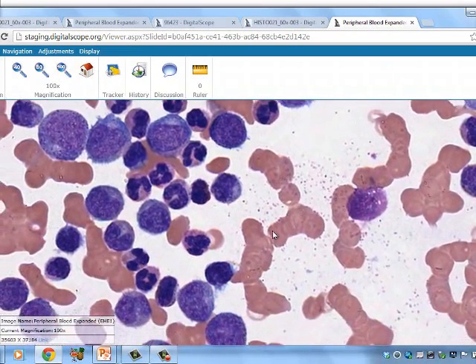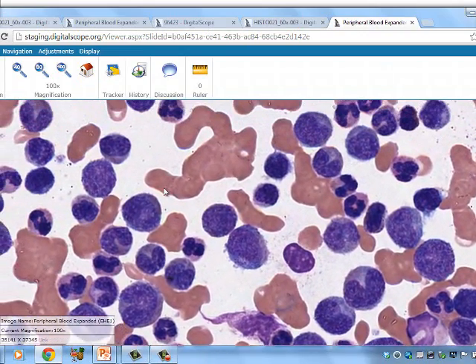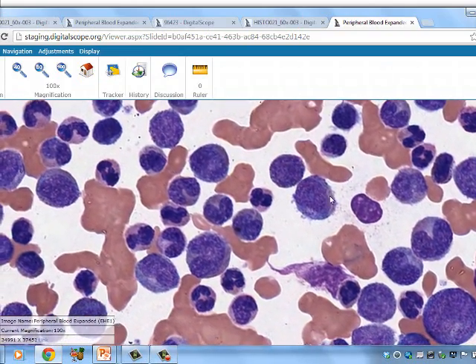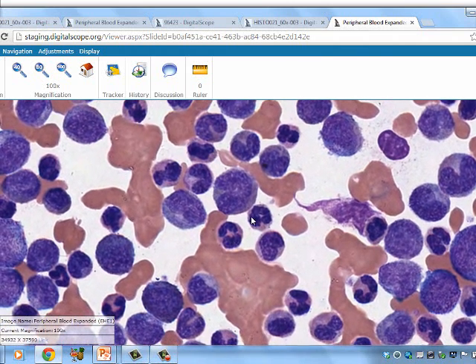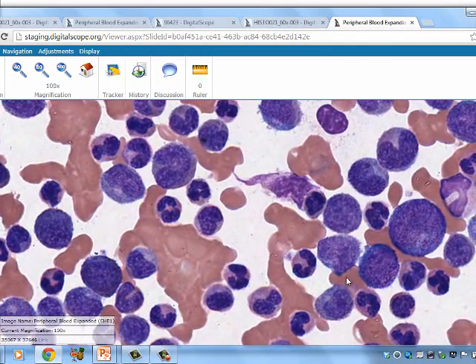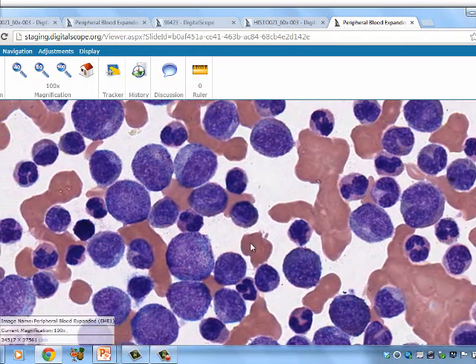And we see the red blood cells, as you see throughout there. This is just debris there. But these would be the individual red blood cells. They're stacked together on these, there's 1, 2, 3 stacked together. These would be the neutrophils that we've seen before. They look a little bit odder. But then we see a lot of these intermediate forms.